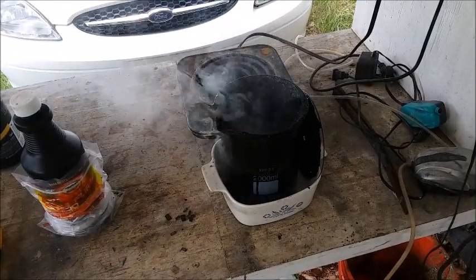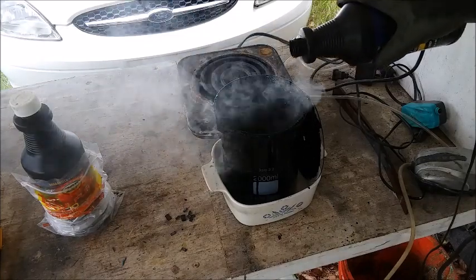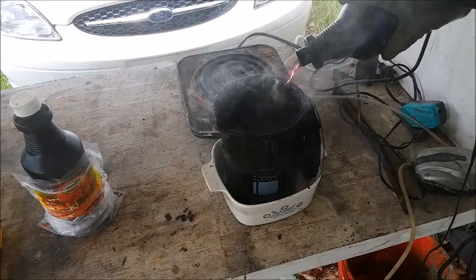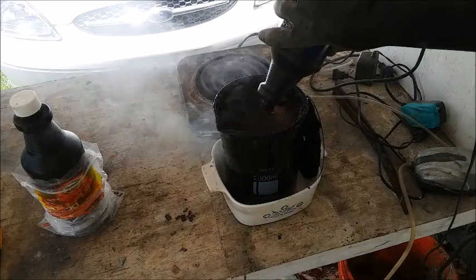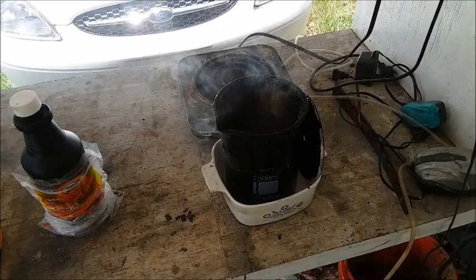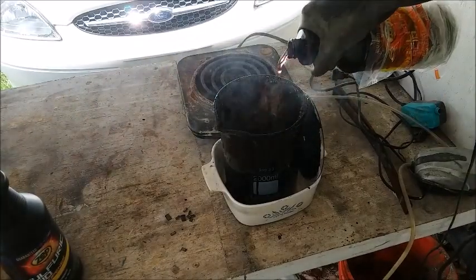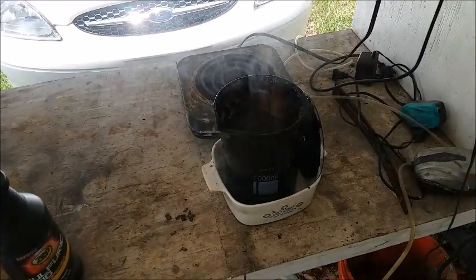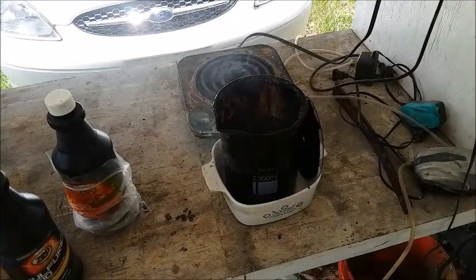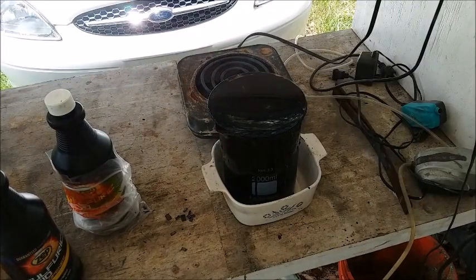Okay. Let me put in some more acid. That really knocks the foam down. It's used up the last of this old bottle. Put in a little more from this new bottle. Okay. And we will leave it to run, although I've turned the heat down quite a bit. My mistake was running off and leaving it on high.